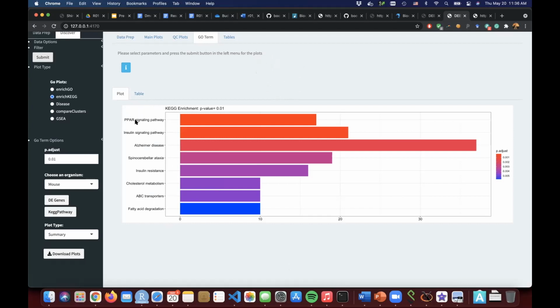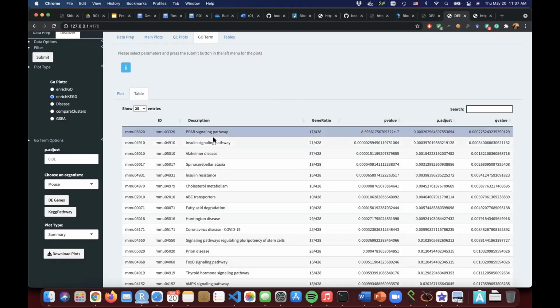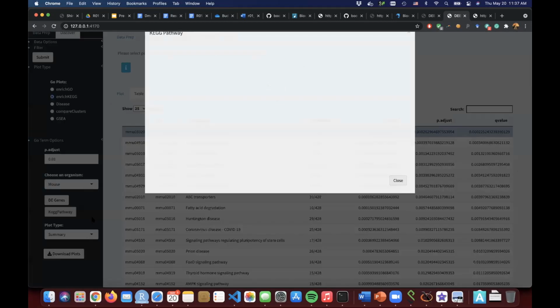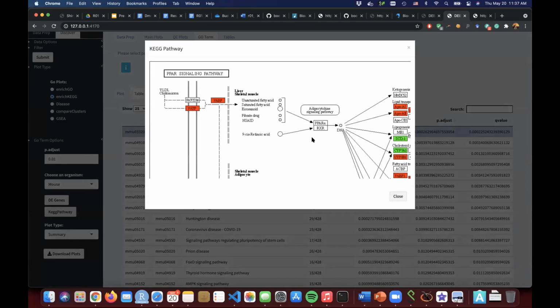This naming is inside the paper title. So it's telling us that this data worked, and you can come here and click on the description of the pathway. And then when you press this button, you can create the pathway. But again, there are better methods than how we are doing the analysis in R here.